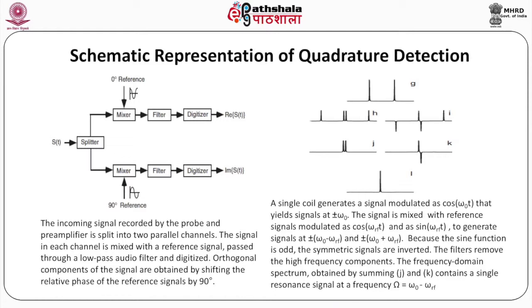Because the sine function is odd, the symmetric signals are inverted, as you see in the second set of peaks.